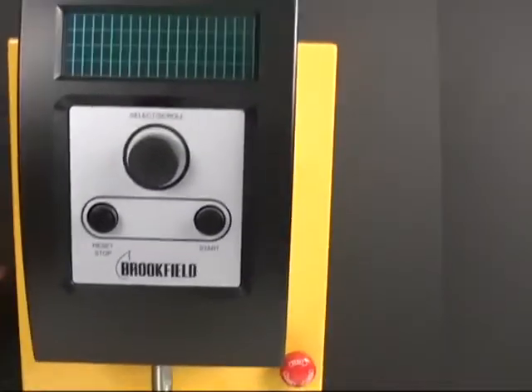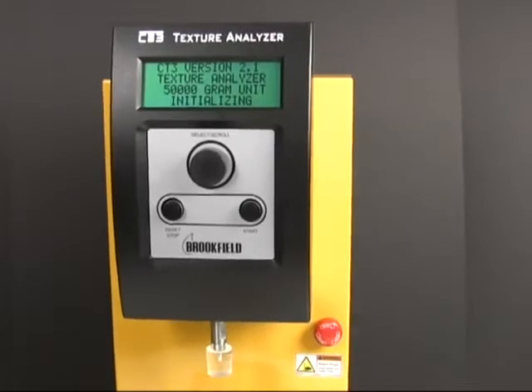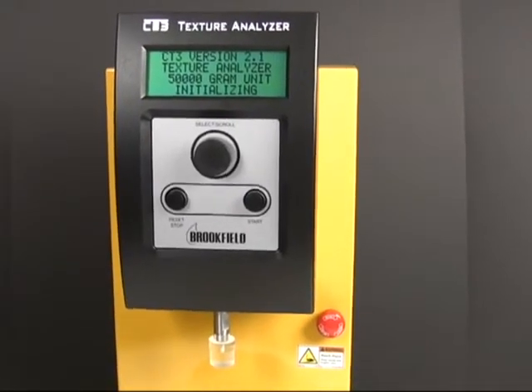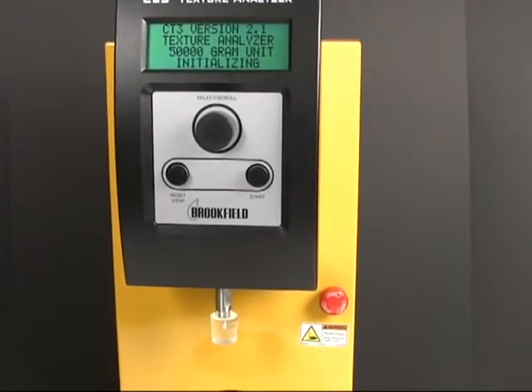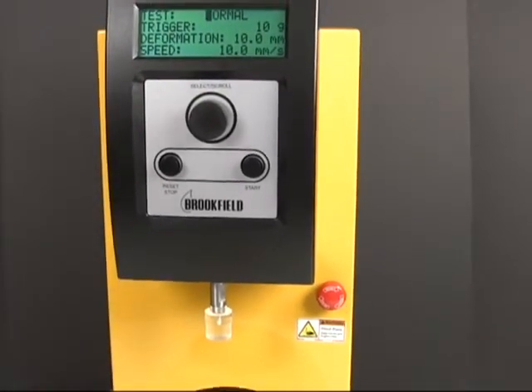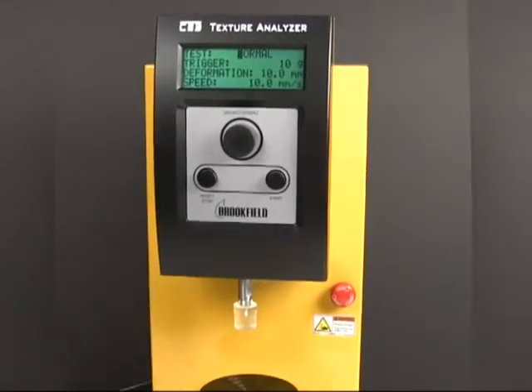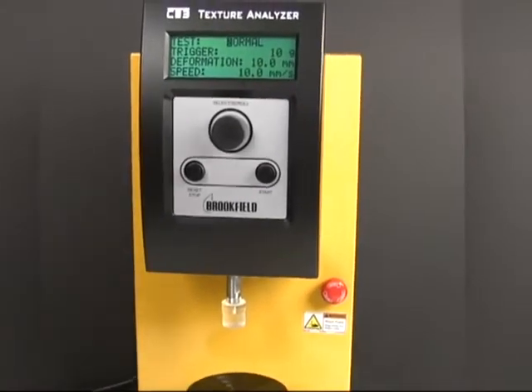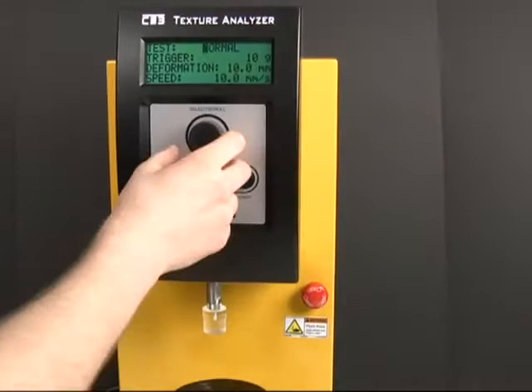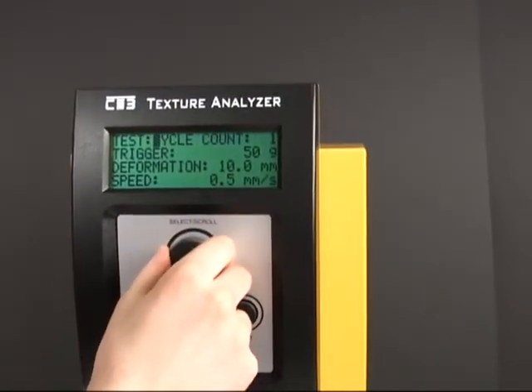I'm going to go ahead and set up a test here and boot up the machine. It likes to do this little auto-adjust to bring it back to the top when it's booted up and reset, and after every test it kind of gets annoying after a while.